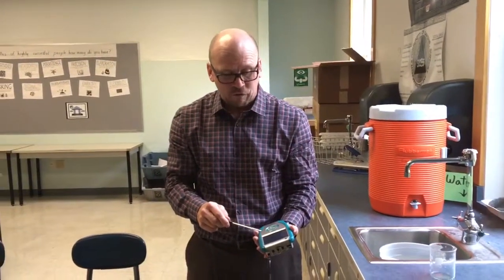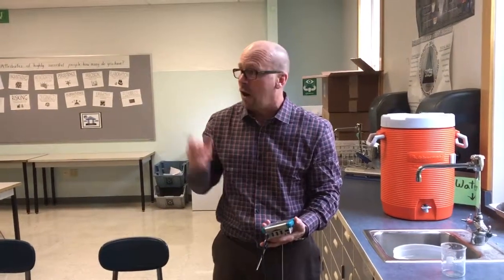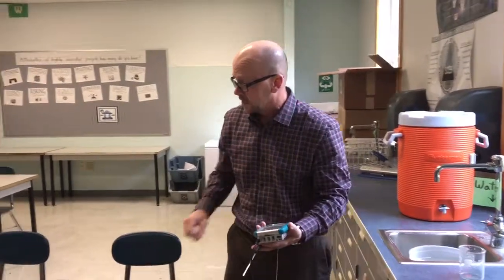When everyone in your group has your graph from your LabQuest copied down on their page, you can take the LabQuest, turn it off, and put it back in my charger so we're not wasting batteries.